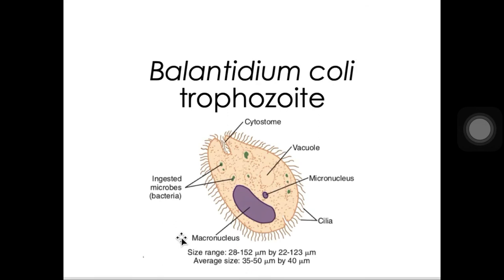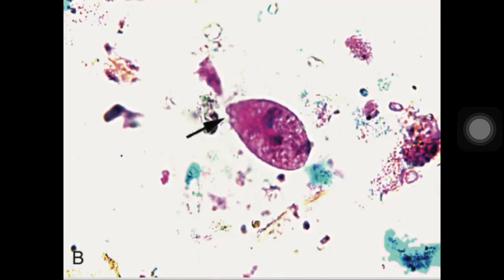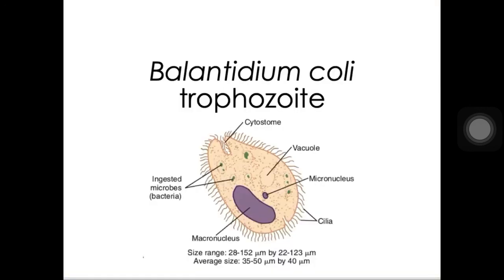The motility naman po of the trophozoite is described as rotary boring motility. Rotary boring motility, yung motility po ng Balantidium coli trophozoite. Okay? So again, that's your Balantidium coli trophozoite. Ito po yung actual na image nga. So again, meron dito ng cytostome for Balantidium coli. We have here the macronucleus. Medyo hindi nakita yung micronucleus niya. Okay? Usually naman kasi kapag sa stain, hindi na makikita talaga yung kanyang micronucleus. Syempre may cilia po na present din doon.